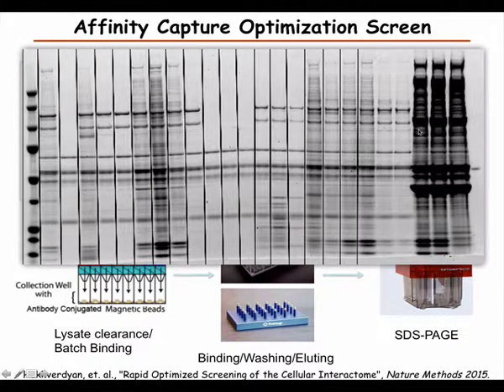But the idea is that by looking through this space, we get very different pullouts, going from probably just the tightest bound proteins to cases where we can add on layers and layers.